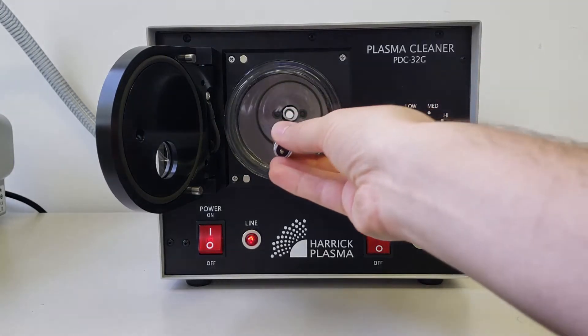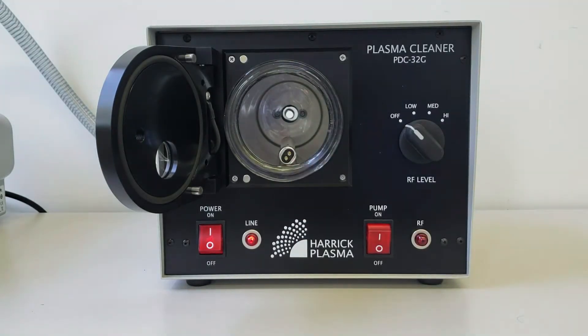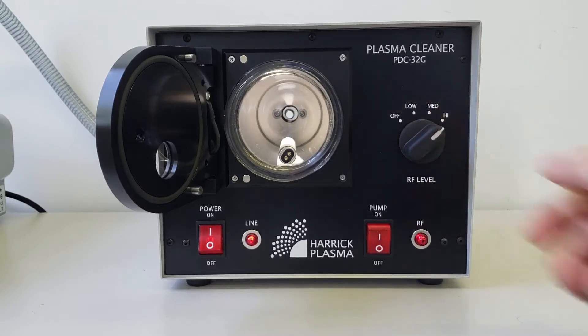Start by placing the fluorescent bulb directly in the chamber at atmospheric pressure. Turn on the RF power to high and wait up to 10 seconds to see if the fluorescent bulb lights up.